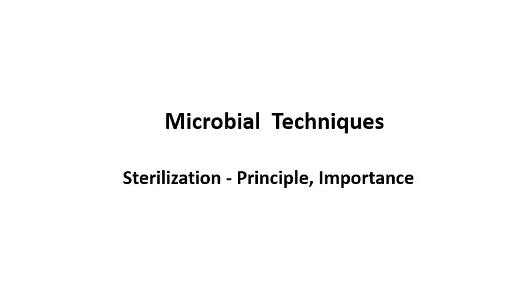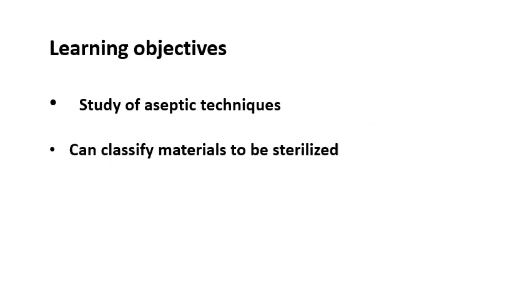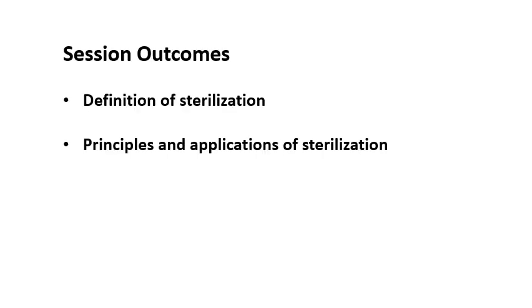So first we will see what are the learning objectives of this session. Here we are going to study aseptic techniques in microbiology. Aseptic techniques are nothing but sterilization techniques. And we can classify the materials which are to be sterilized and which are to be used in the microbiology laboratory. And what are the session outcomes?